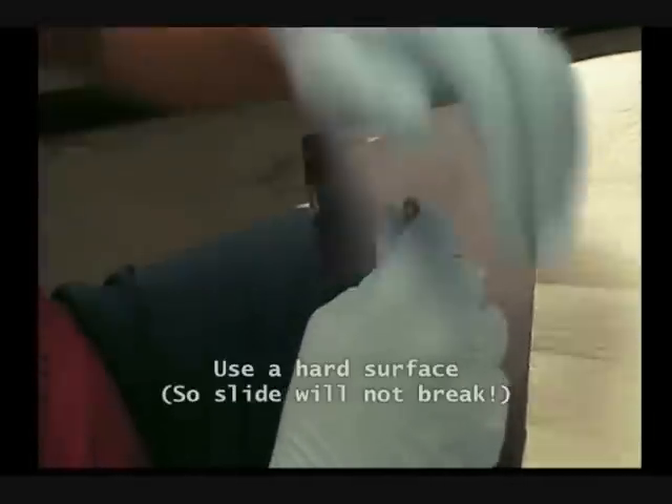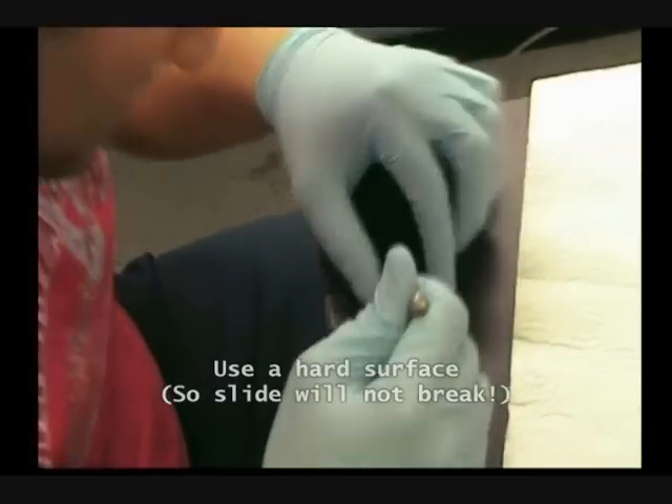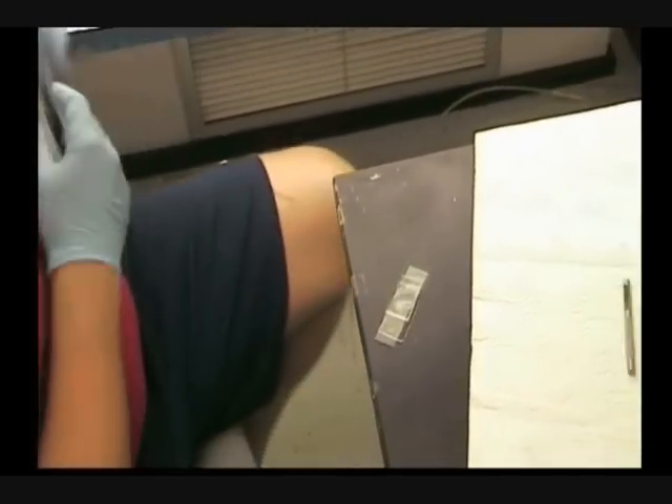It needs to be done on a flat surface. That's why I am using this table. Now I'm gonna punch the openings for the electrode. I'm gonna use the smaller punch for that one.